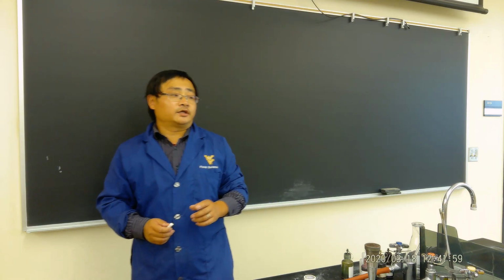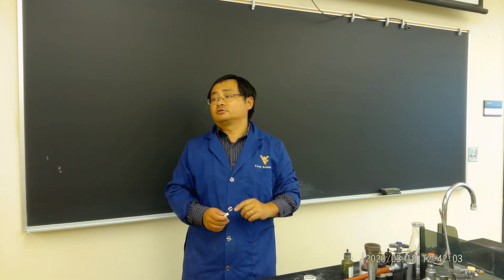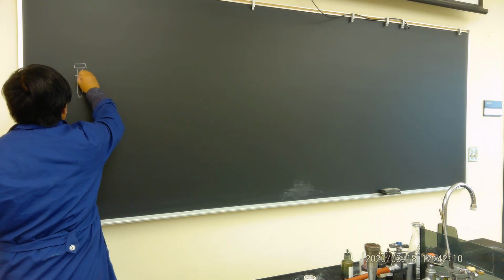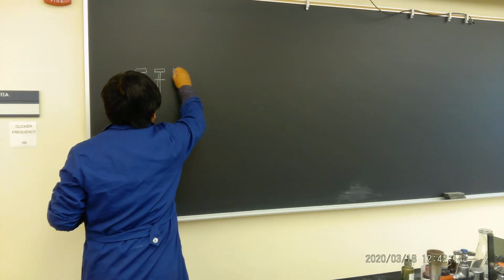Okay. So let's have a class. Now, everybody should have your results. Let's talk about those tubes first. So you have those 3 tubes, fermentation. I just want somebody to show others the results.